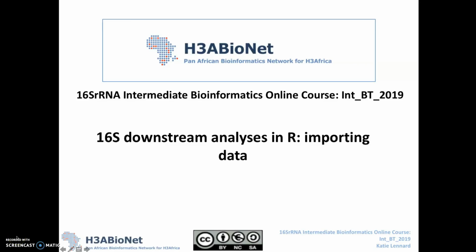So in this module, I'll be teaching you guys how to analyze your data downstream in R. So the 16S data, the ASV table, and the taxonomy that you generated in the previous module, we're going to be importing into R and then doing some downstream analysis to interpret the data.